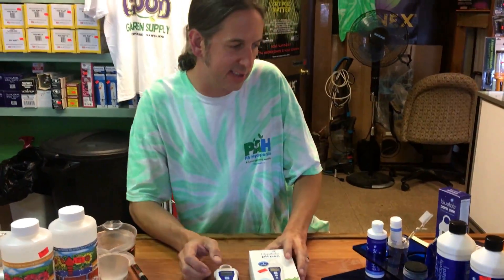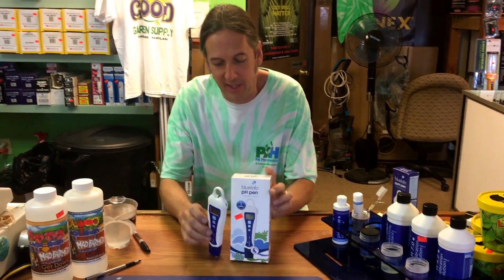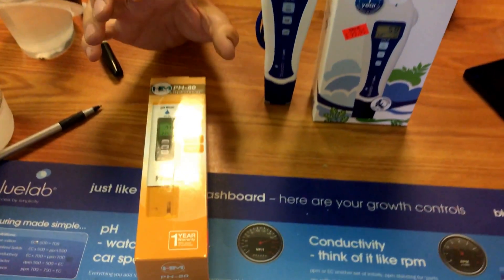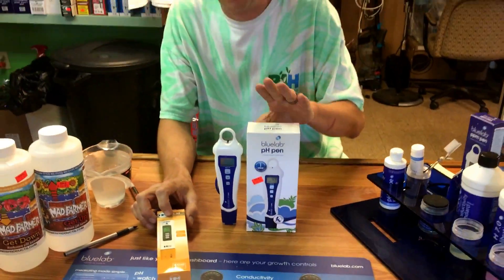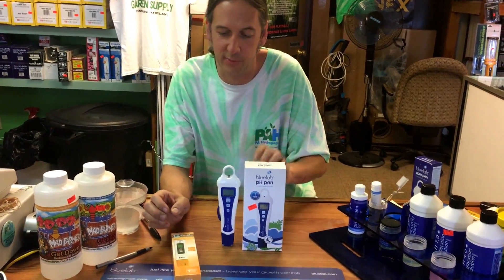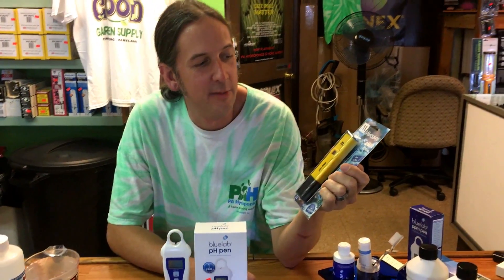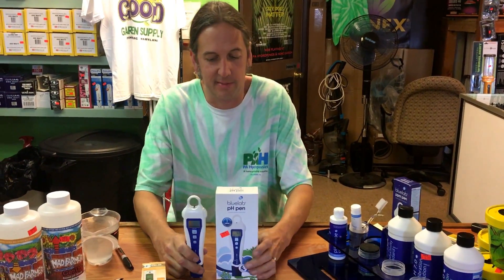The meters themselves — there are lots of different brands. A lot of people come in and grab a $9.95 meter off the internet that lasts about two weeks. You get what you pay for. Bluelab is our favorite brand — they hold up, last a long time, and get to a reading really quickly. The HM meters are a lower-cost option and seem to hold up well. This one is waterproof. The Bluelab — our rep said one was sitting in a tank for months and worked perfectly. The cheapest meter here is not waterproof, so if you drop it in your tank, it's done. I definitely recommend spending a little extra — Bluelab is awesome.